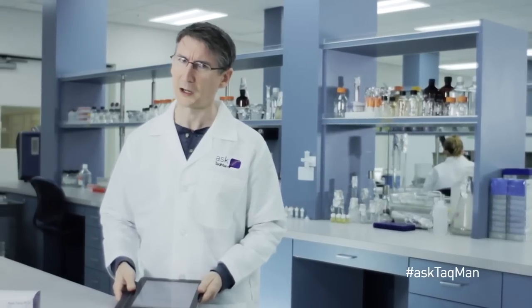Dear Sir, I wish I could. PCR does in fact have phases, but it's normally difficult to see these in action. That said, once we do real-time PCR, we can easily visualize its phases. Fortunately, real-time is where these matter the most.